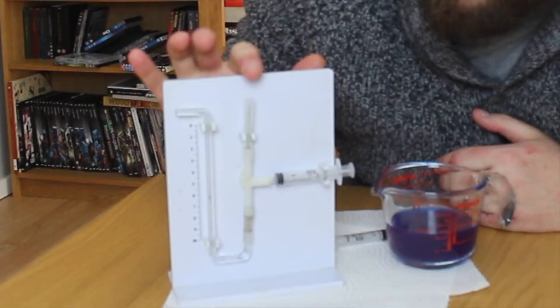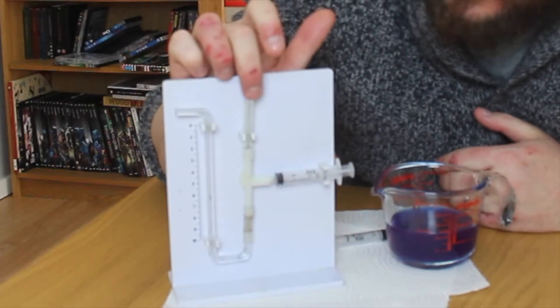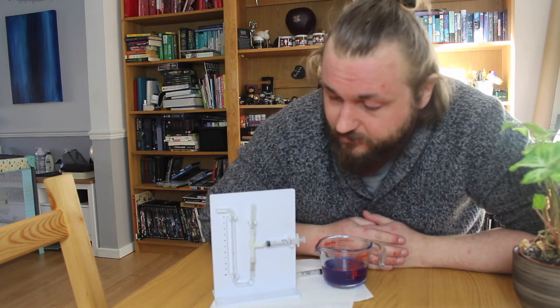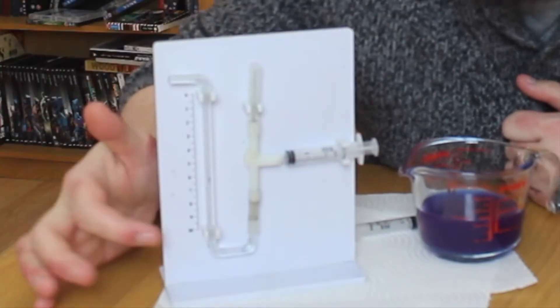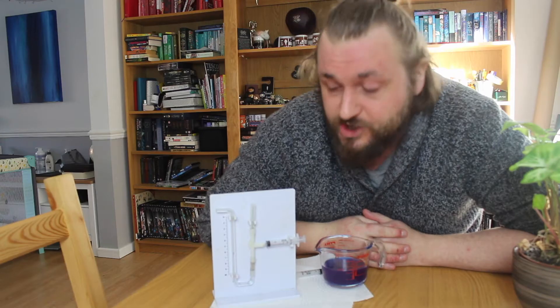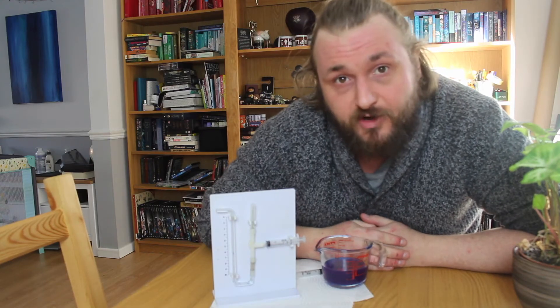In a potometer, what you generally have is a place where you can put a leaf or part of a plant, what's called a reservoir which is used to refill or reset the potometer after use, and then some sort of graduation. Here I've got some numbers at the side which can tell us how much water is being evaporated out from the plant.